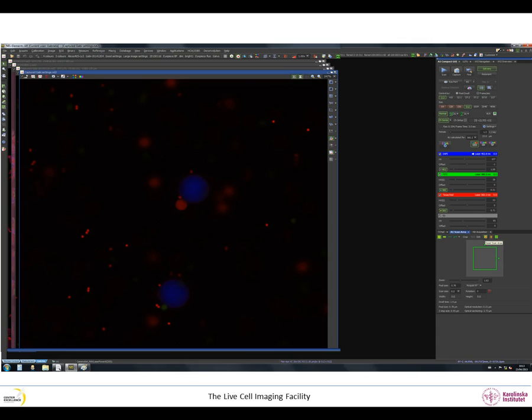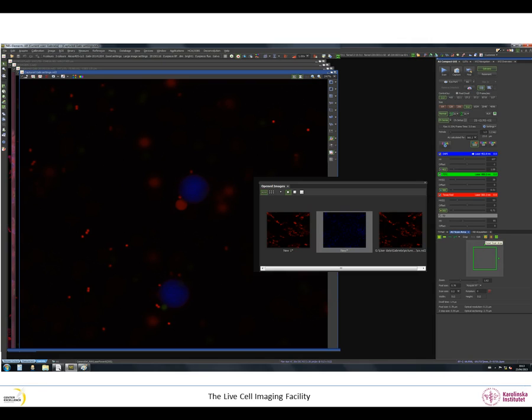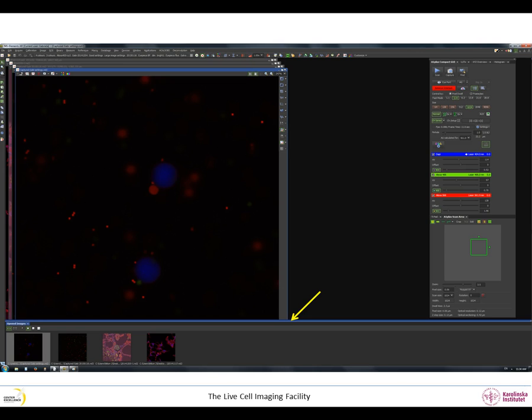If you want to add additional tabs to your layout, for example the tab Open Images, right click on the background of the NIS Elements and choose Visualization Controls and then Open Images. The Open Images tab will be displayed. Drag the tab to the right, left or bottom of the NIS Elements window until you see a purple bar. Release. The tab is now displayed at the location you've chosen and you can save it as an integrated part of your layout. You can in the same way add several other tabs.